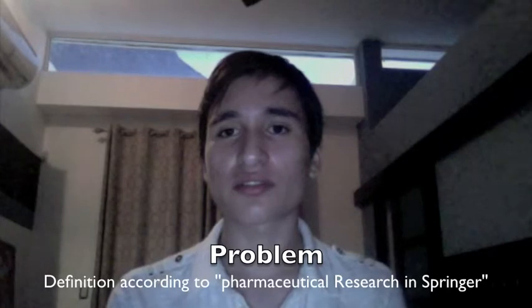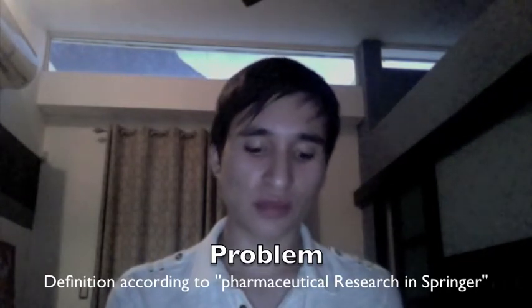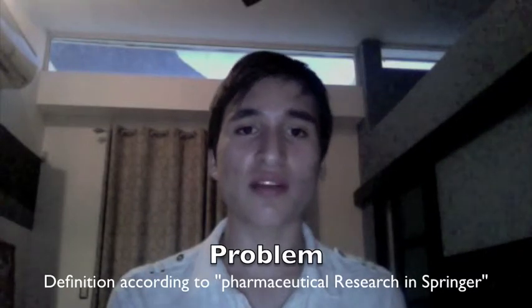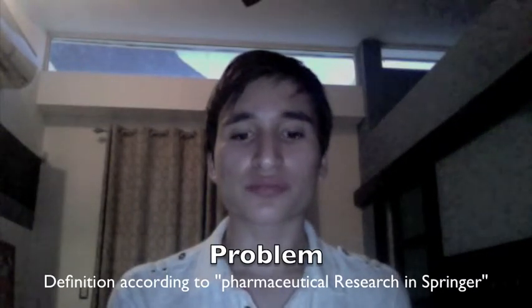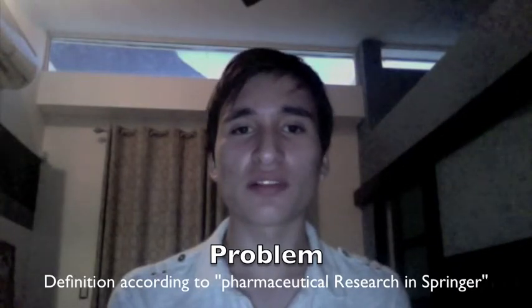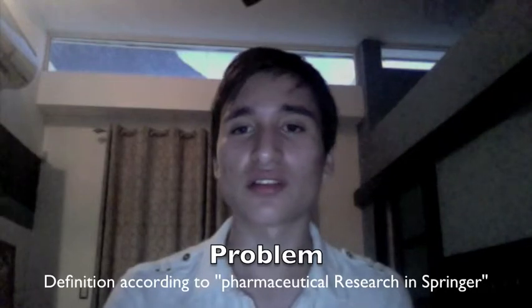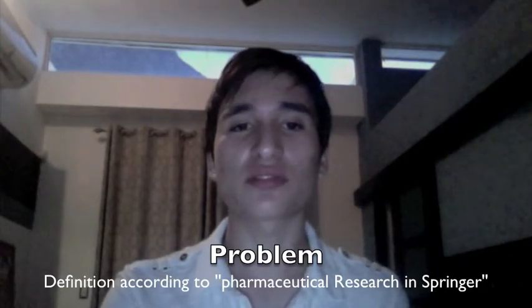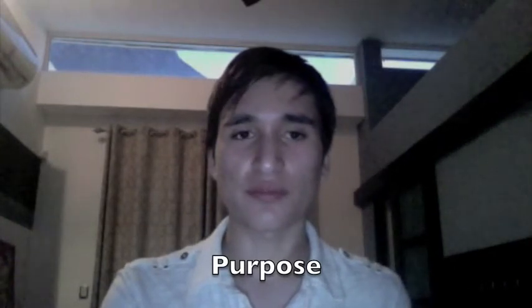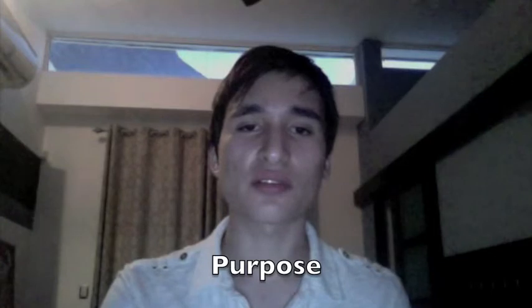In our course of investigation, we chose an experiment about lyophilization. And the problem was that lyophilization processes generate freezing and drying stresses, destabilizing the protein structure caused by dehydration. The purpose of this was to stabilize the proteins for better usage.